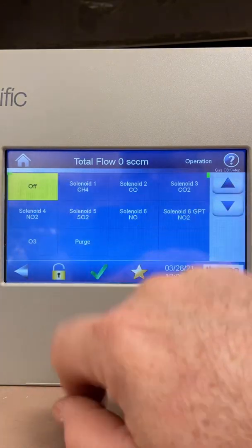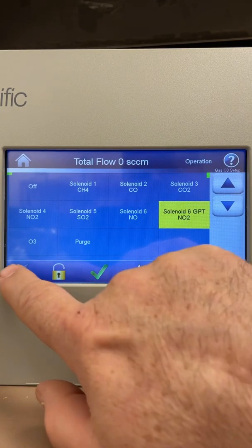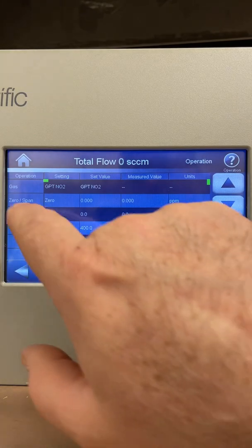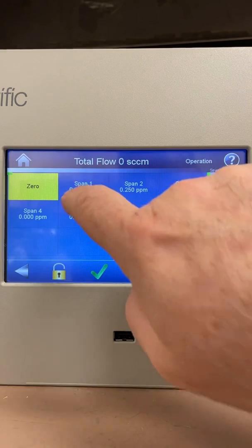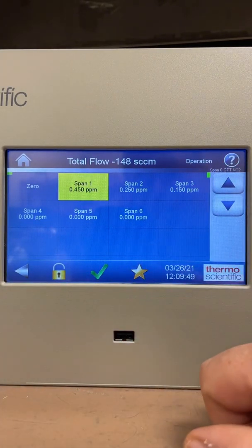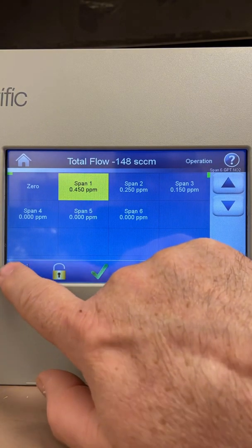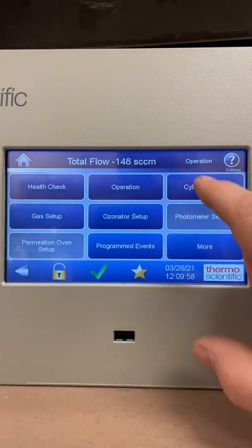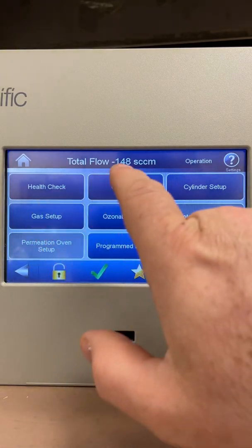Once setup is done, go into Operation and select solenoid 6 GPT. It's doing a zero right now. Go back in, pick span 1, and you'll hear two valves click — there they go — and now it will be pulling in NO, mixing with ozone to make the NO2. So a little bit of screens to set up first: the cylinder setup, the ozonator setup, and then you can go into your operation.